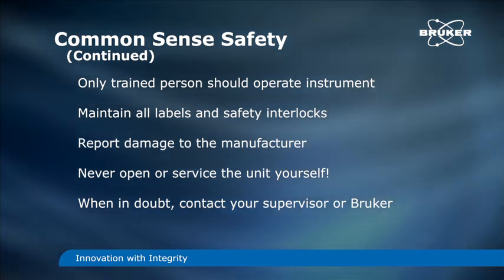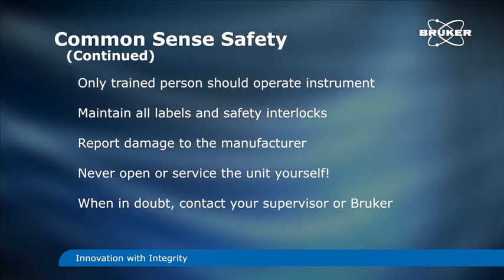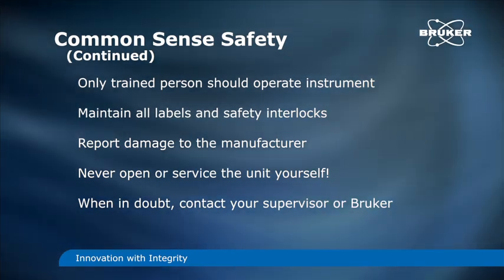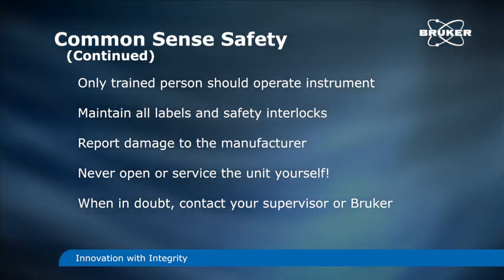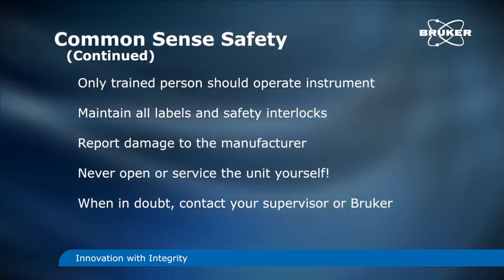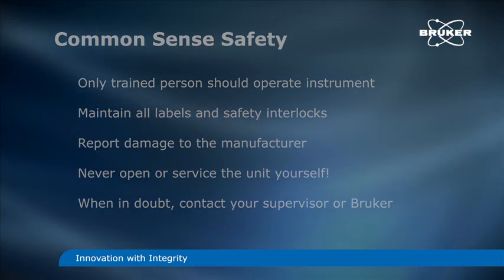Do not remove or deface manufacturer radiation labels. Never defeat or tamper with safety interlocks. Report any damage of your analyzer to the manufacturer. Never open or service the unit yourself. When in doubt, contact your supervisor or Bruker Elemental for assistance.